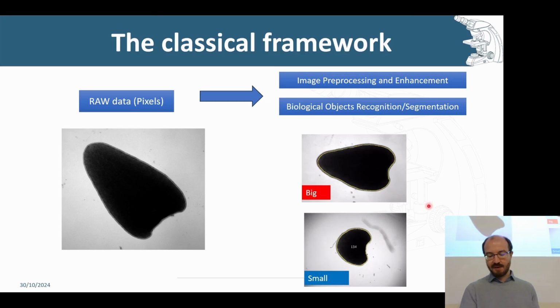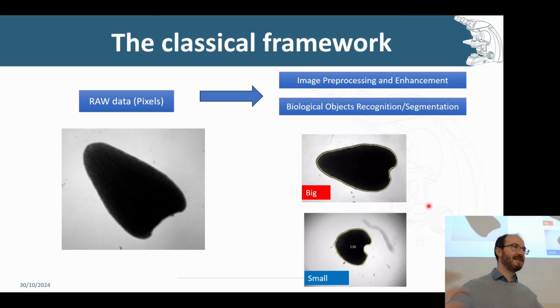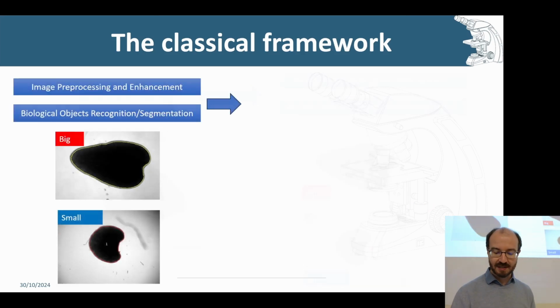And then we have, for example, a big one and a small one, and we can look with our eye and we can see the frequency of pulsation that's going on here, but now we want to model this statistically, so that it's not just our eye, or we don't want to manually go and count through the frames, okay, how many frames did it take? We want to have an automated way so that we can do this in high throughput data settings, where we have lots of these things, and we just put it into some pipeline, we click run, and then it gives us all of these frequencies out so that we can do very robust stats on it.